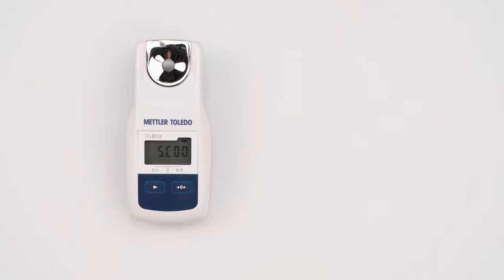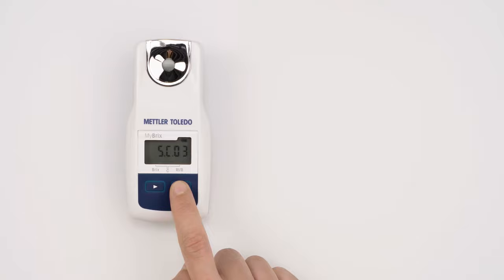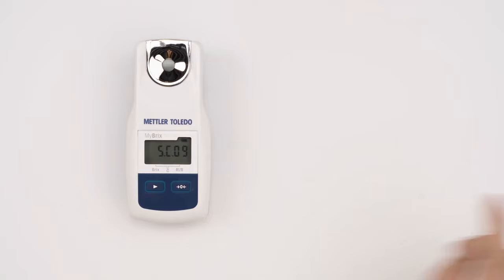Continue until you find the number that represents the scale you want to select. For example, scale 9 is Plato.